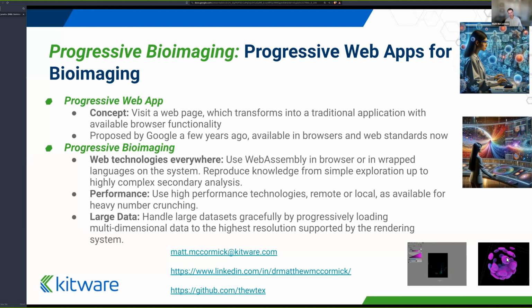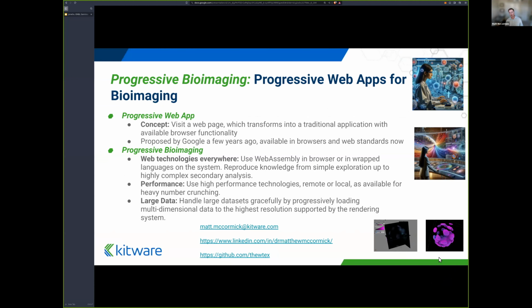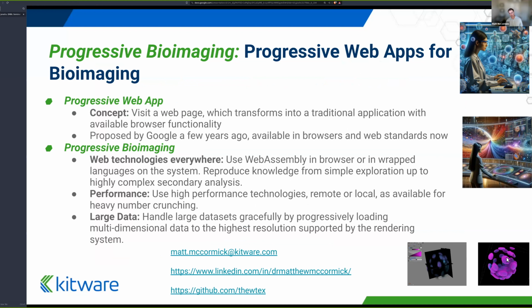At the same time, these new approaches require more compute power, different software, oftentimes a GPU. So that's what's really exciting, and making that available when it's available is exciting to me. So a lot of the focus, I think my focus, is making that available, but progressively available, because you can generate these beautiful images, but also, like you said, I agree, having these shadows, you can really see more in your data. And I defer to different groups that are working on the rendering algorithms for that, like Dan at the Allen Institute. But what I think is really exciting, and what my focus is on, is making that available when it can be available.